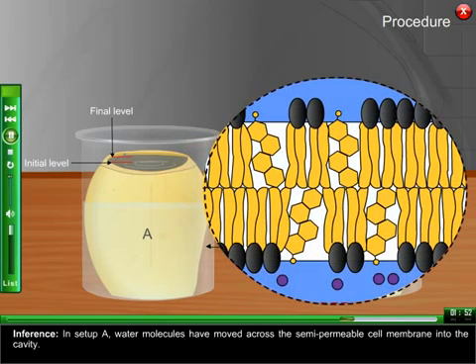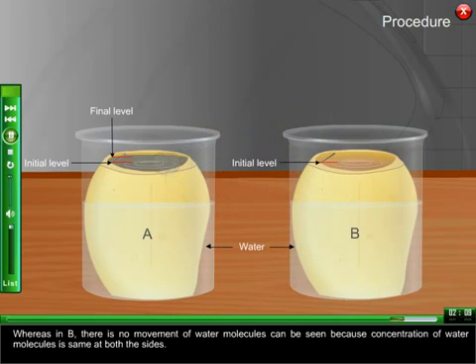Inference: In setup A, water molecules have moved across the semi-permeable cell membrane into the cavity. Whereas in B, there is no movement of water molecules because concentration of water molecules is same at both the sides.